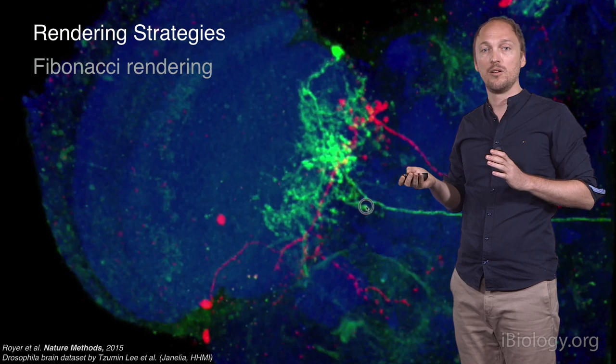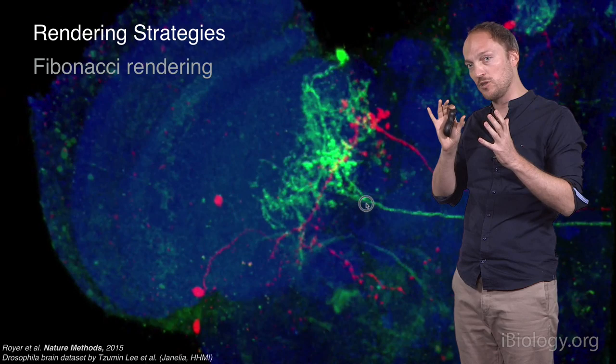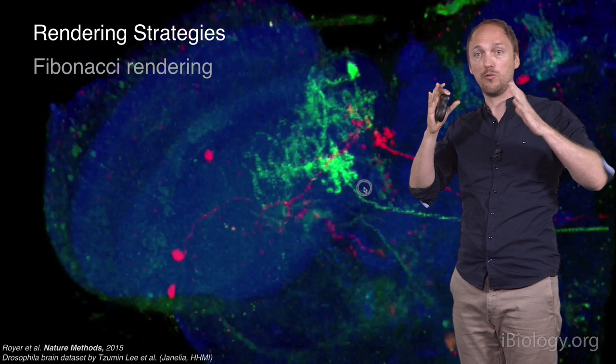Here is how it looks like in practice. This is a very large multichannel image of neurons within the Drosophila brain. As you can see, interaction is fluid, and quality recovers as soon as the movement is stopped. The multipass algorithm is active during interaction, and when we stop interacting with the volume, the image is refined and finally displayed at its full quality.